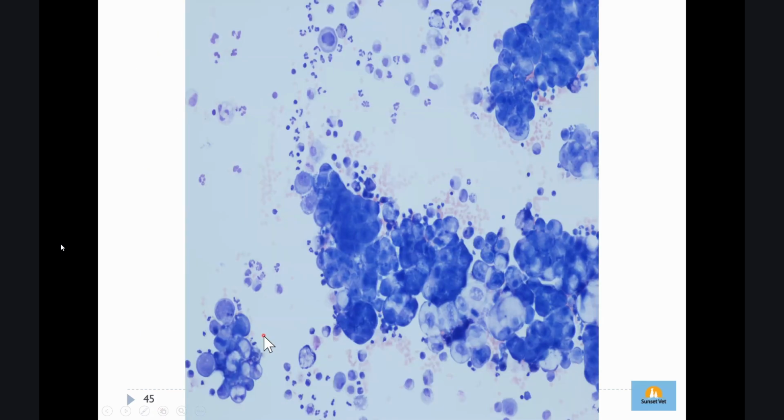Let's discuss this one. So as you can see here, typically, let's say the easy way: the cell, there is a big one, there is a small one. And then you can see, this is a very big cell, this is a very small one.